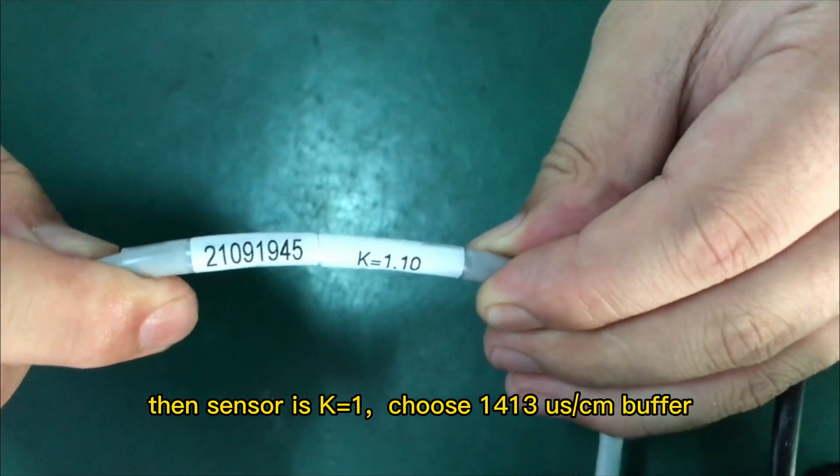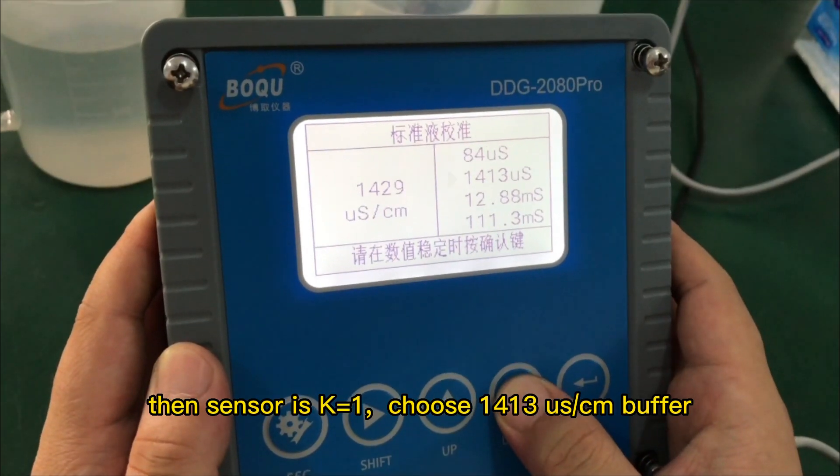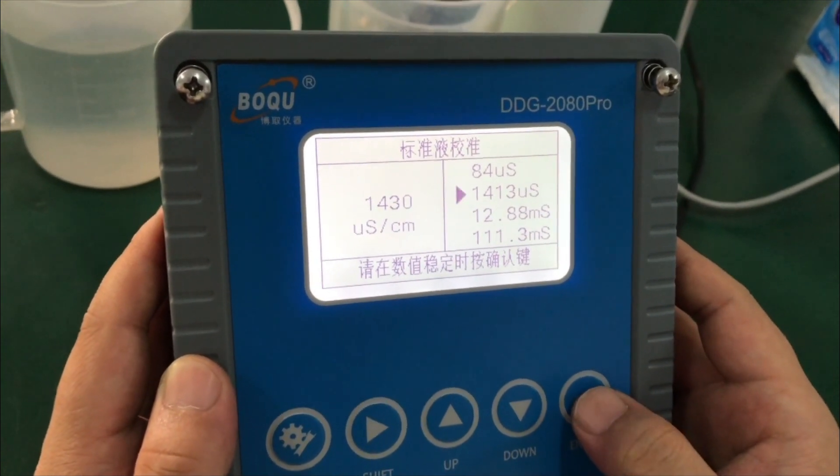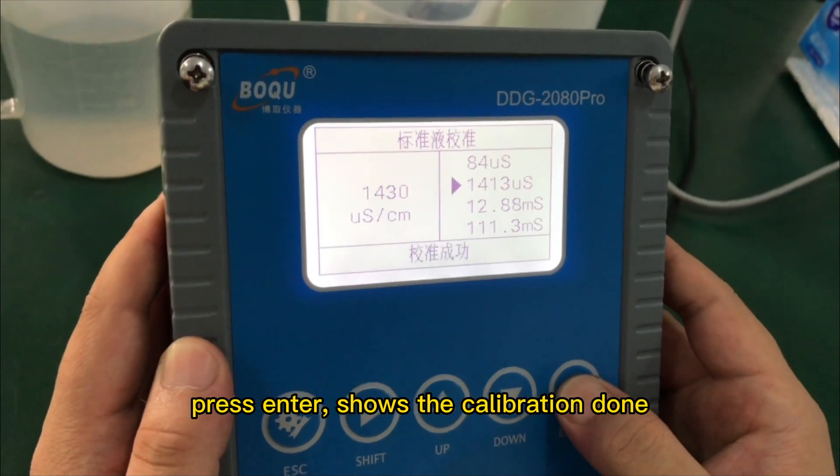The sensor K is equal to 1. Choose 1413 uS/cm buffer. Press Enter and wait for 10 to 20 seconds, then press Enter again. The display will show calibration done.